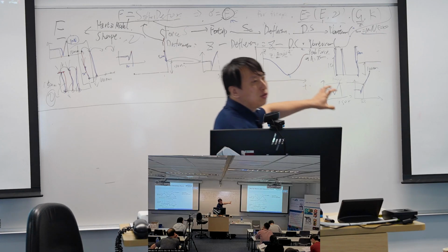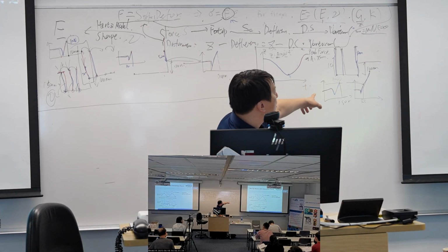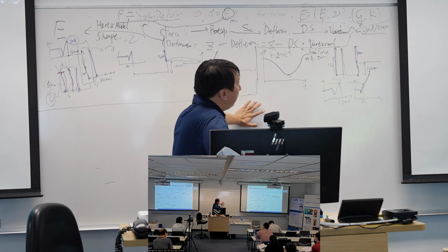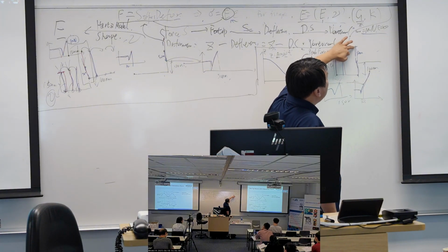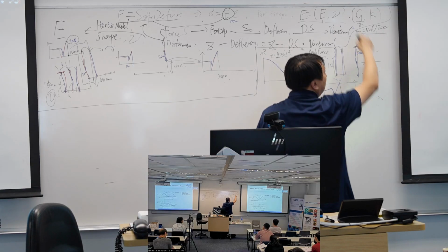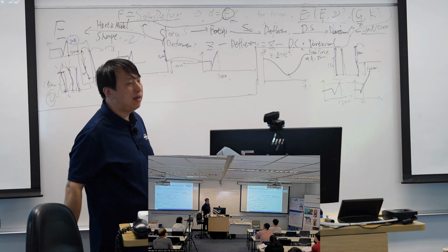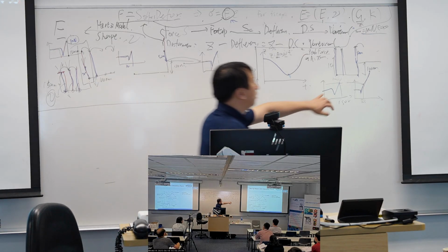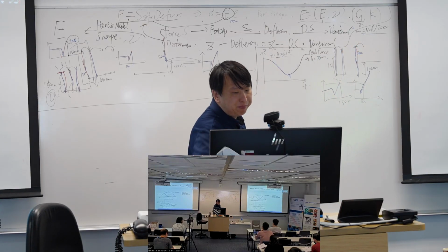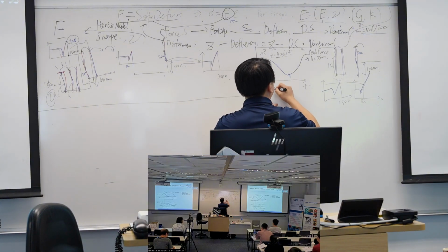So we will use another logic to do this kind of imaging. If we do not move, if we still keep our probe here, once it jumps, it will keep doing this. Then my force setup is sacrificed. Actually, the force is significantly larger than 1 nanonewton. So we change this to a feedback.